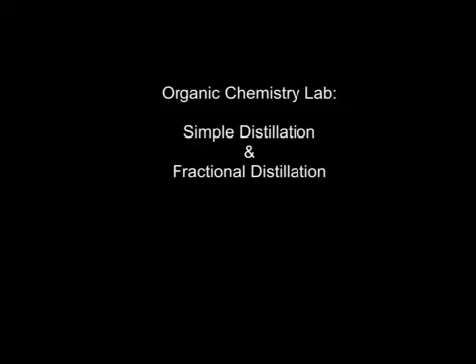Hi, my name is David Garcia, and today I'm going to be talking about our organic chemistry lab, which is the experiment of simple distillation and fractional distillation. To introduce the topic, distillation is the combined process of heating a liquid until it boils and passes into its vapor state, followed by the condensation of that vapor into a liquid. In this experiment, the student performed simple and fractional distillation to separate ethanol and water in a mixed solution, comparing the two different methods of distillation.